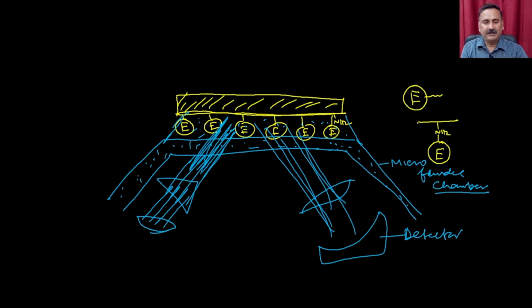And I have already conjugated the enzyme. I can conjugate any of the pairs, like the antibody or antigen or any kind of pairs. And what I'll do is I'll first collect the spectra. If I have done that, I can collect the spectra and see how the binding is happening or not.